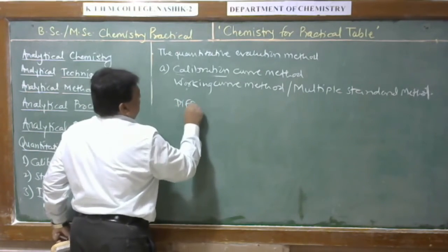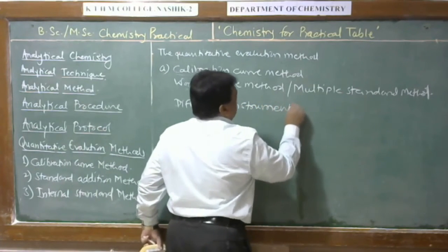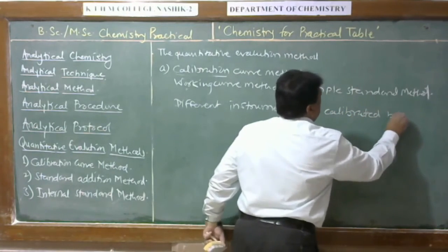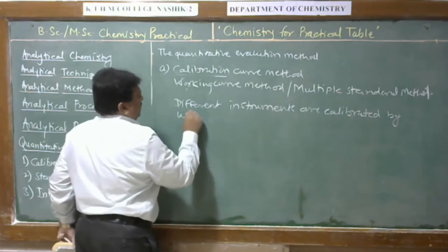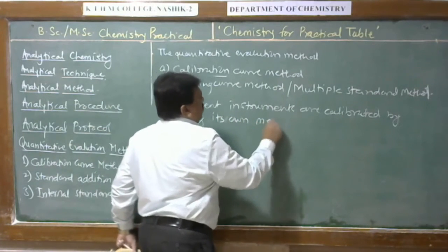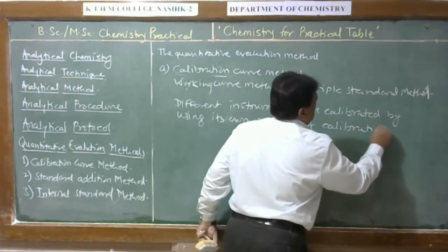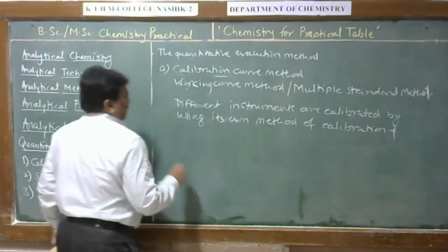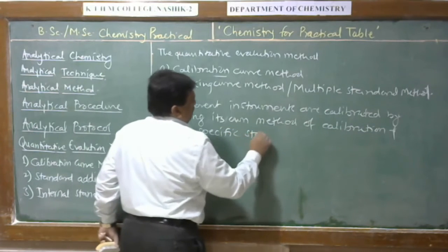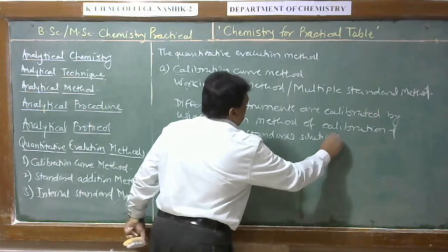Different instruments are calibrated by using their own method of calibration and specific standard solutions for calibration.